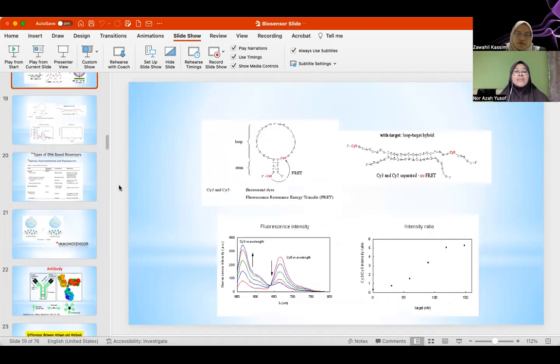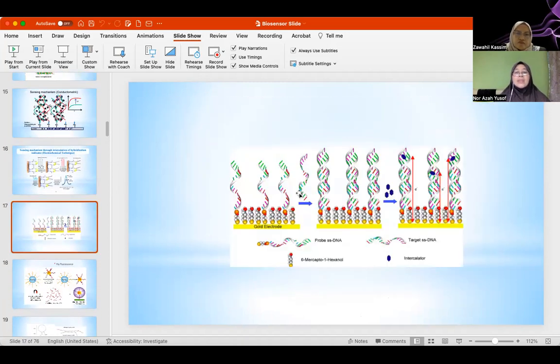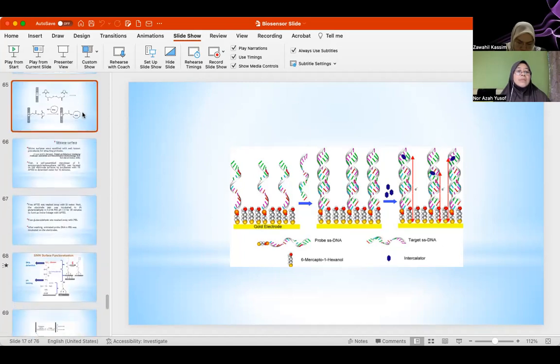Same goes with DNA. Because DNA is usually negatively charged, since nucleic acid bases are negative, and it has a phosphate backbone, also negatively charged, the strands might get tangled to each other because of the charges. Unless we use a proper chemistry, we're not going to get the DNA probe standing up. A proper chemistry has to be strategized and chosen so the DNA probe can stand up. If not, it will definitely lie down. I'm going to show you what happens if we don't use a proper chemistry. Just a moment.